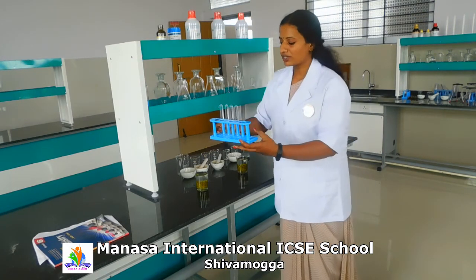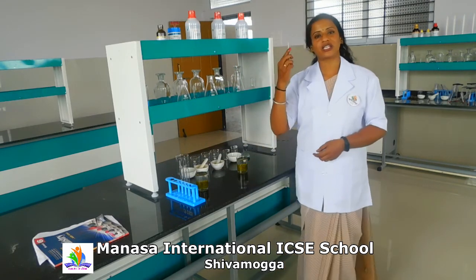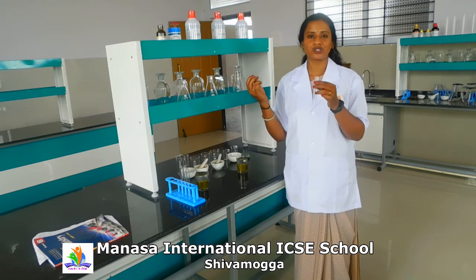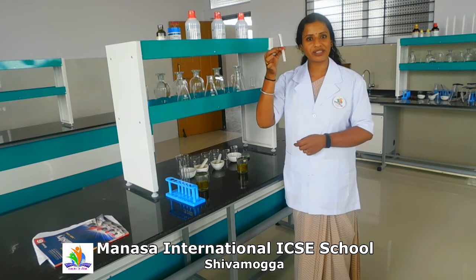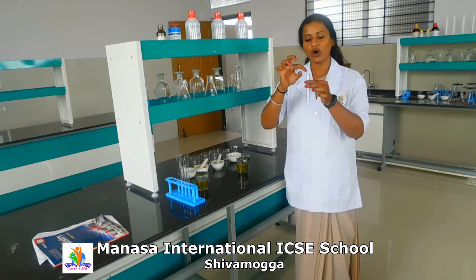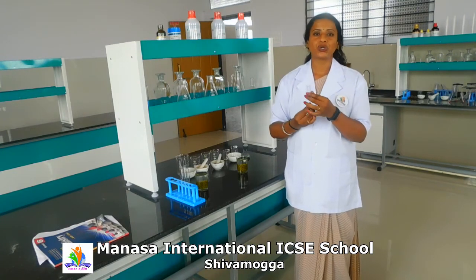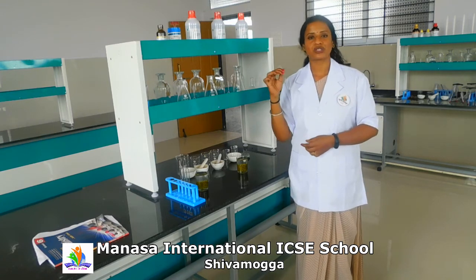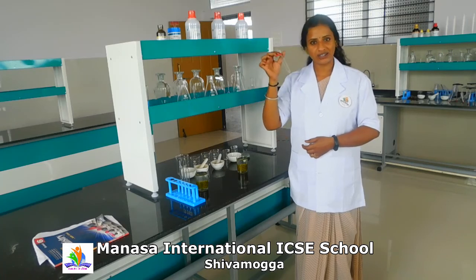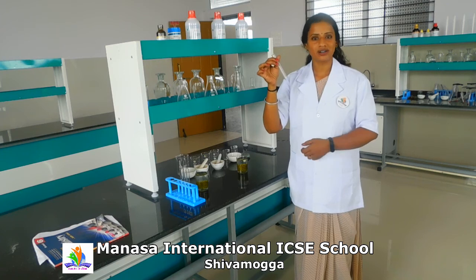The speciality of this glass is that it can withstand high temperature as well as very low temperature. If you take ice water at 0 degrees, it will withstand that. And if you take boiling water, it can withstand up to the temperature at which the glass is manufactured. So usually in the laboratory we prefer borosilicate glass so that even in heat experiments, this glass will withstand and we get the results.